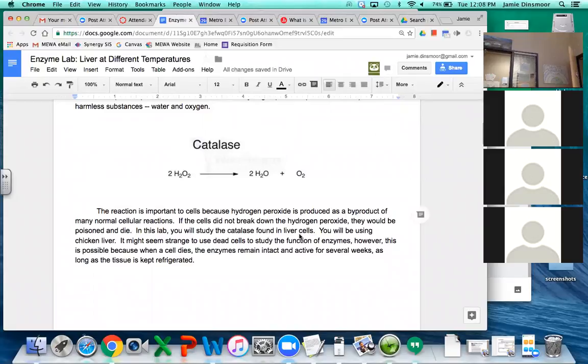Do you need the letter? No. You're thinking, okay. All else fails, we'll use the microwave.